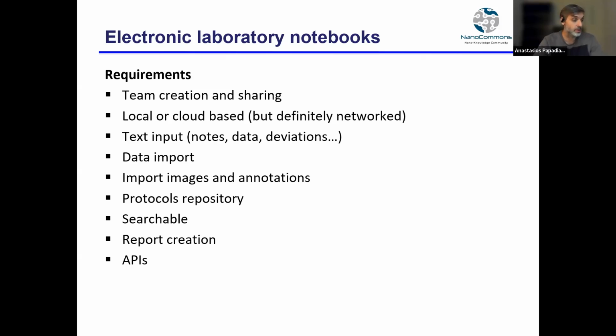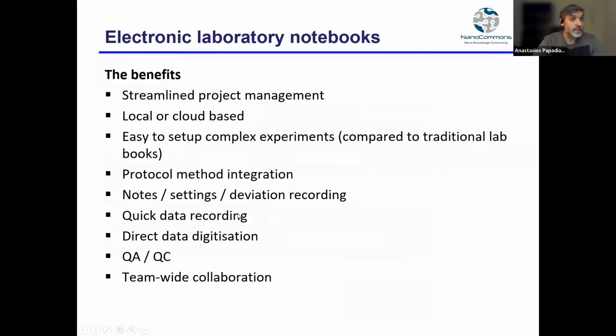And in this way, it's more or less a good starting point instead of having to start from a blank paper. And in the future, you can interconnect these tools like the ELNs with other, let's say, databases or repositories, etc., as we're going to see, so as to either send or pull data. So what the ELNs provide us is the introduction of streamlined project management into everyday scientific practice. So we approach everything like a project that needs to be managed accordingly. They can be locally or cloud-based.